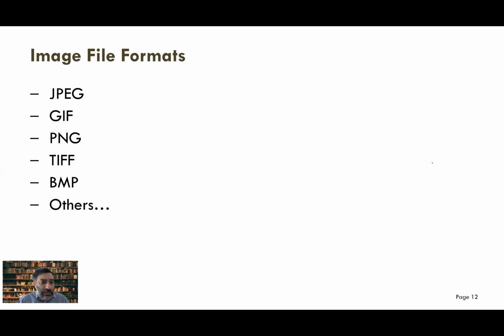We usually come across various file types: JPEG, GIF, PNG, TIFF, BMP. You have seen them. But in research, the best images are the TIFF images.